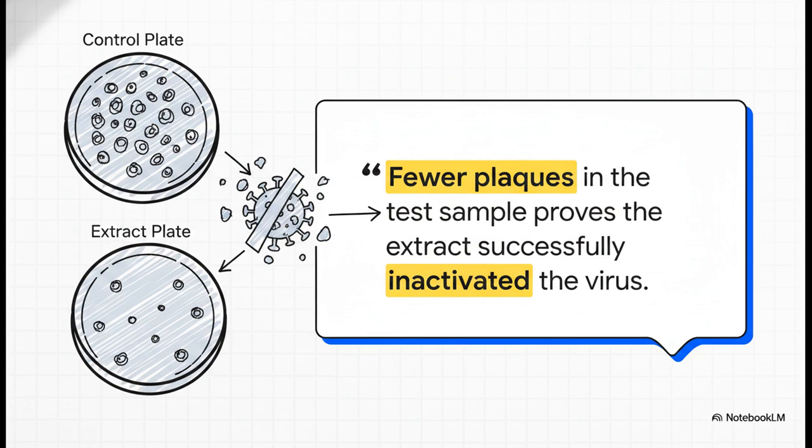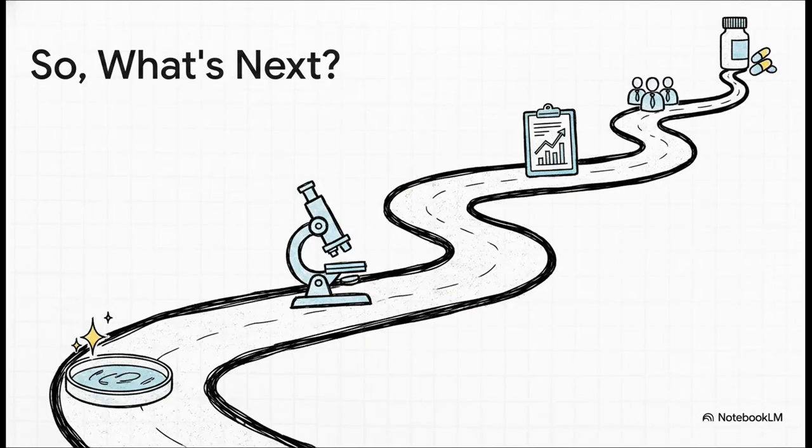And that's really the whole story, right there. That visual difference says everything. If the plate with our extract has way fewer dead spots than the control plate, well, we have our proof. The extract successfully neutralized the virus before it ever had a chance to infect the cells. Case closed.